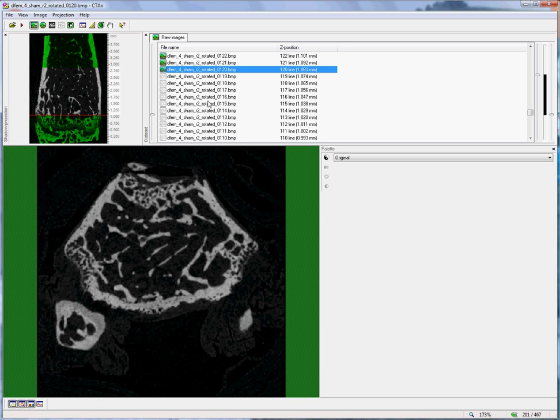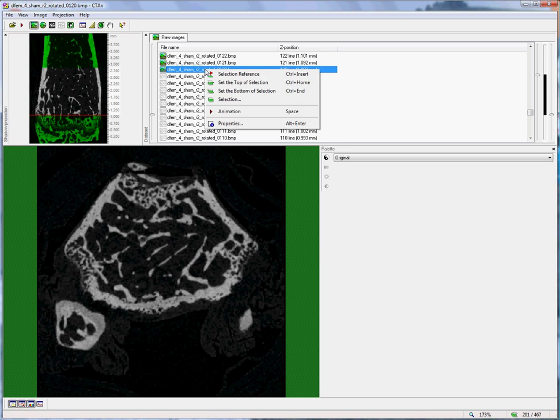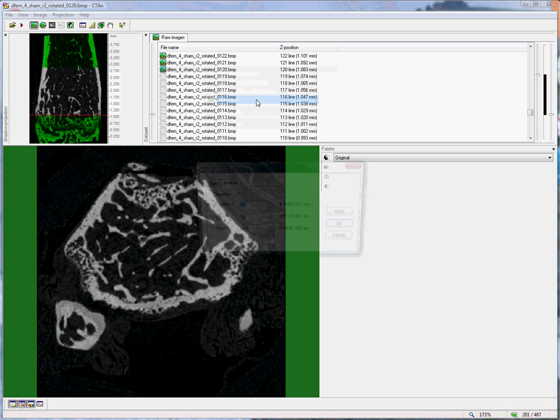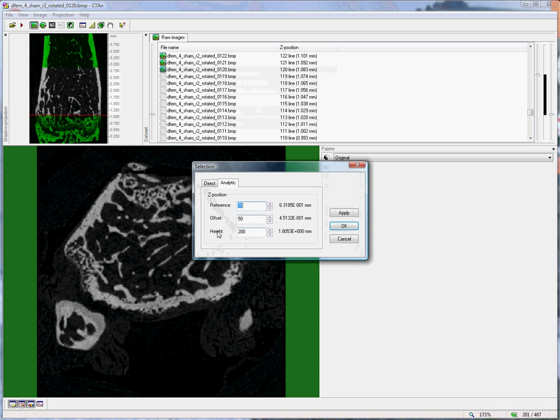In this case, I've used 50 slices, but you can decide for yourself what is the appropriate number. If I right-click again and go down to the selection item, then I can enter these two parameters, the offset and the height.